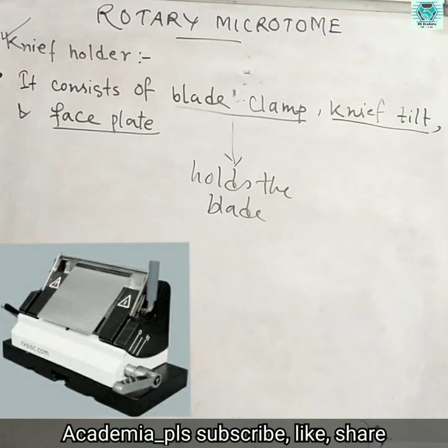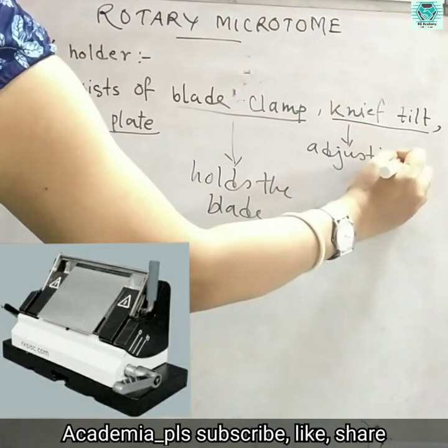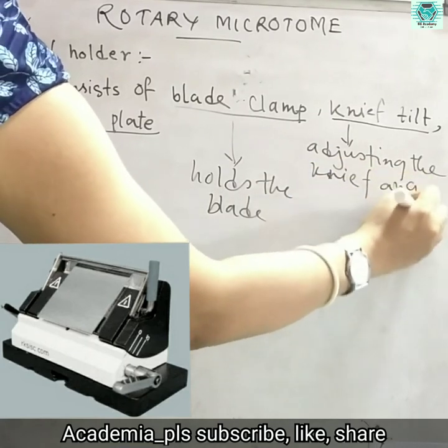Then what about the knife tilt? It is used for adjusting the knife angle.